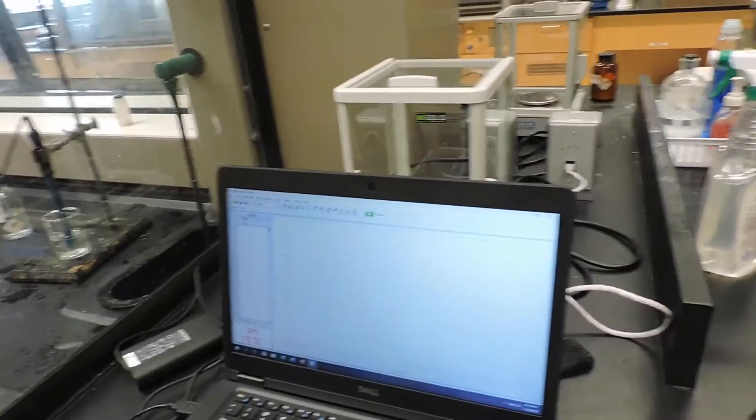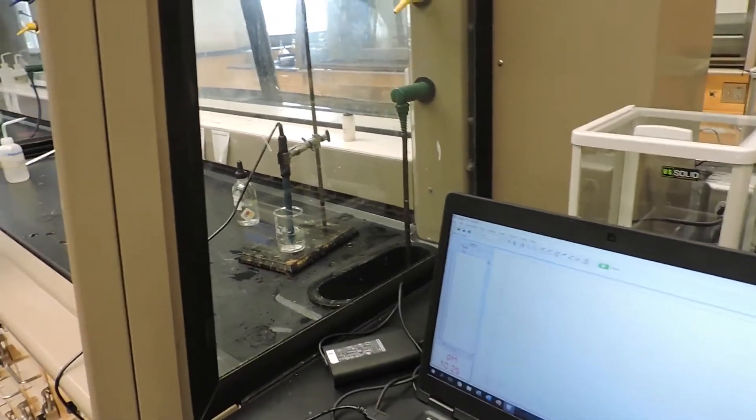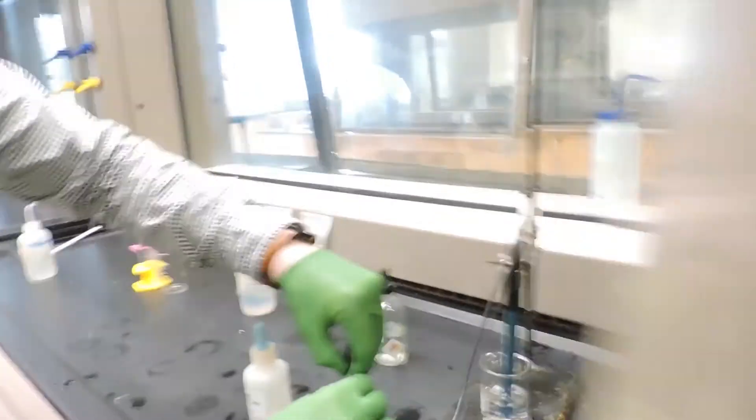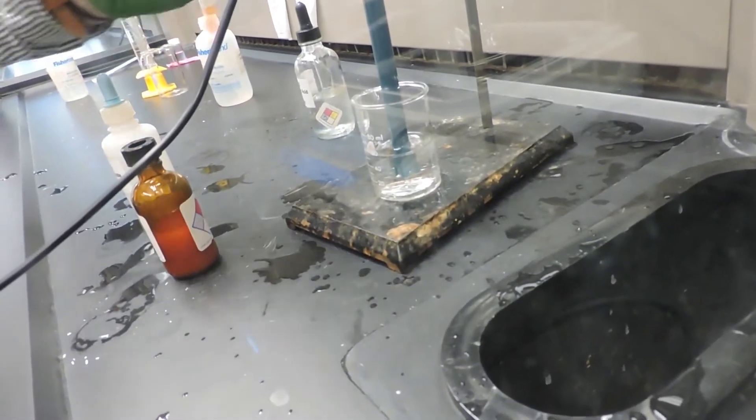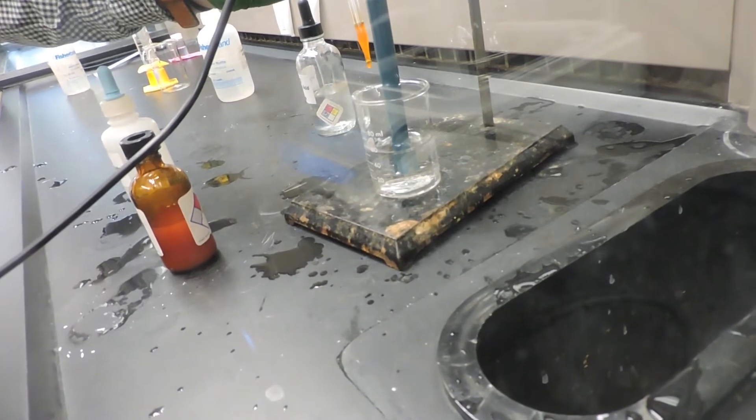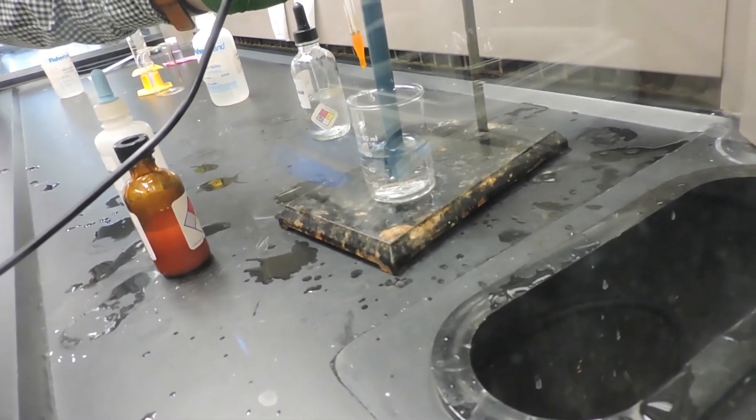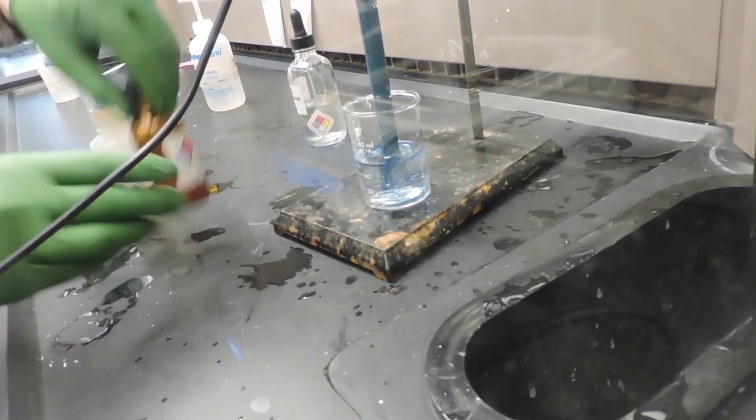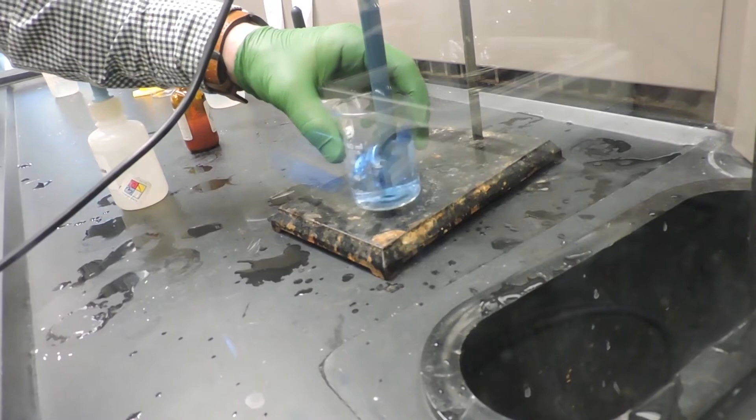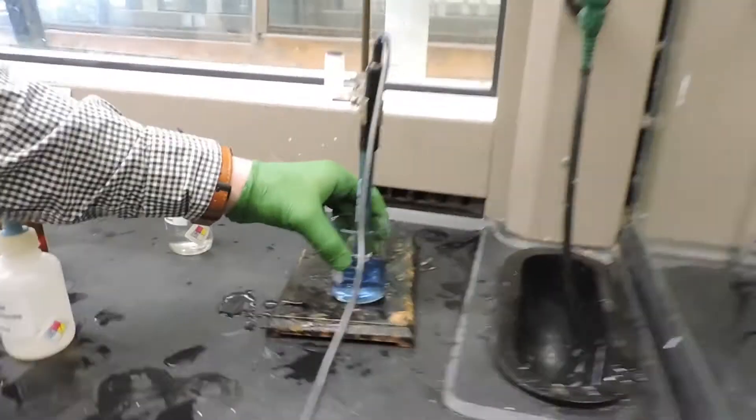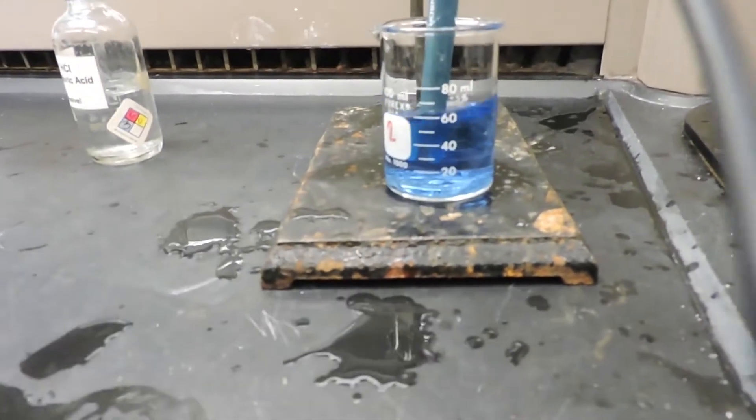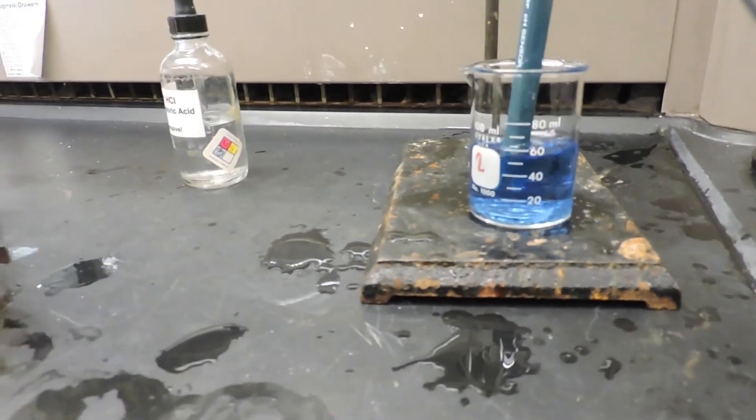Next, we're going to add three drops of a Bromo Blue indicator to our solution and note what color it changes. This is a really nice blue color now.